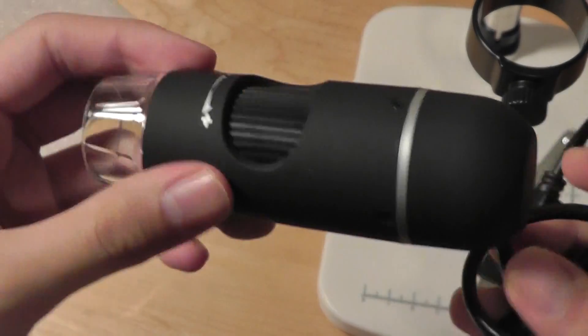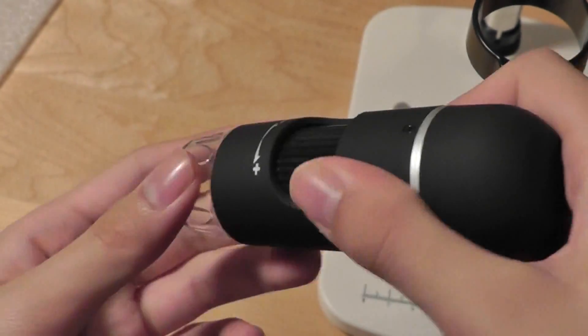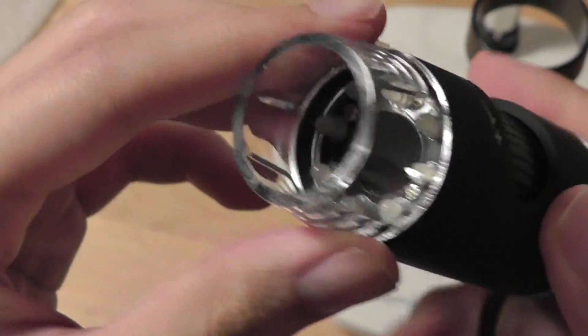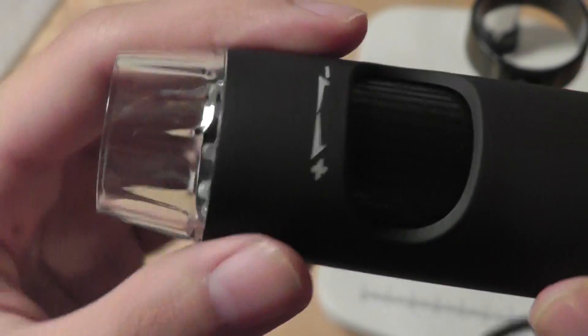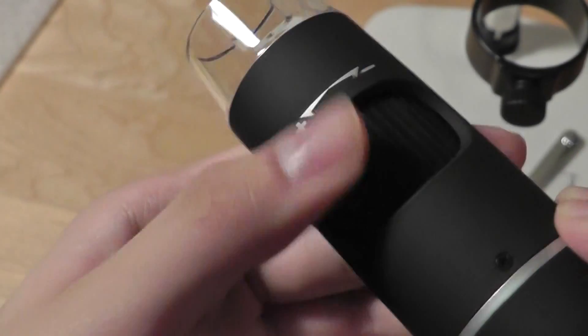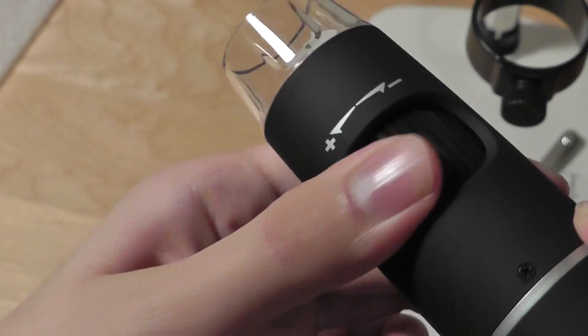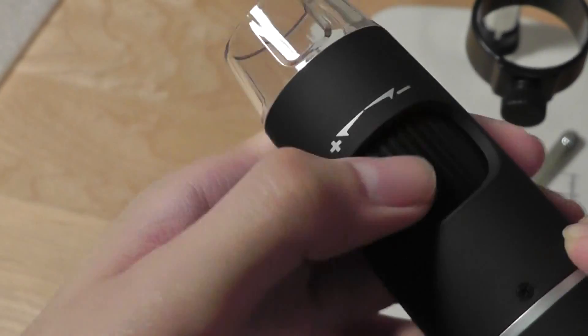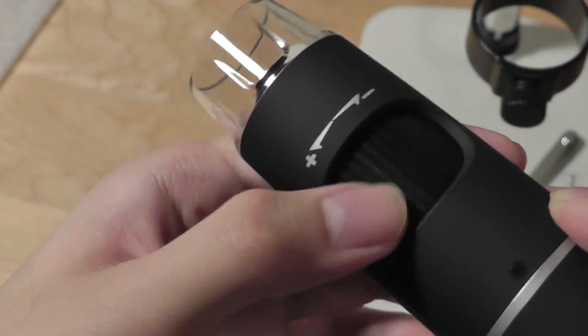Taking out the microscope itself, it's crafted out of a soft-touch material which makes it easy to grip and hold in case you need to use your hands rather than the stand. On the top there's protection for the lens of the microscope and the eight LEDs inside. Focusing is relatively easy — it's a simple jog dial to scroll between magnification: zoom in to the left and zoom out to the right. It's actually quite sensitive and you can get a pretty accurate focus just by using this mechanism.